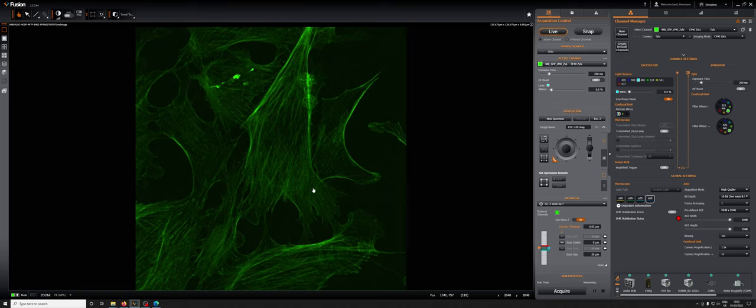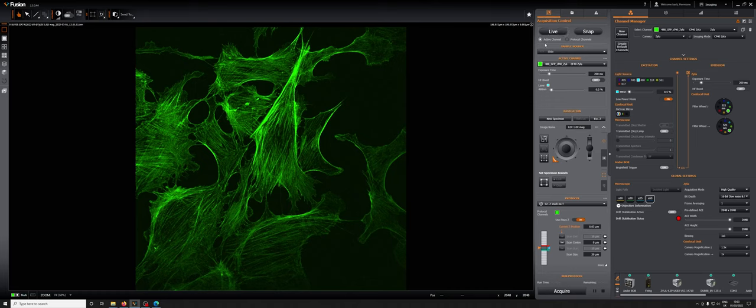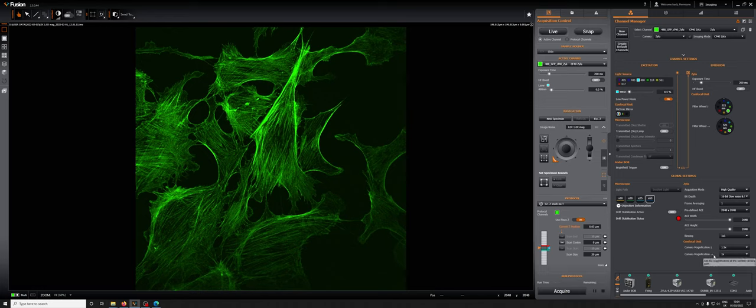That is how you change the magnification for the Zyla. If you wanted to do something similar for the Ixon, instead of using this lens you need to use this one, because in the nomenclature of this microscope, camera magnification with the arrow pointing to the side refers to the far camera, which on this one is the Ixon EMCCD.